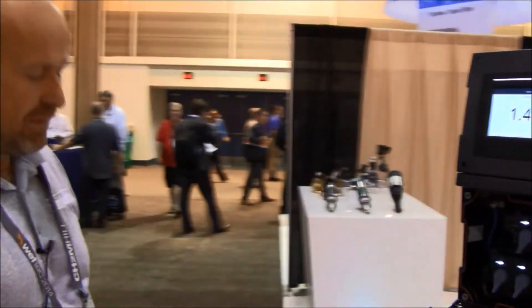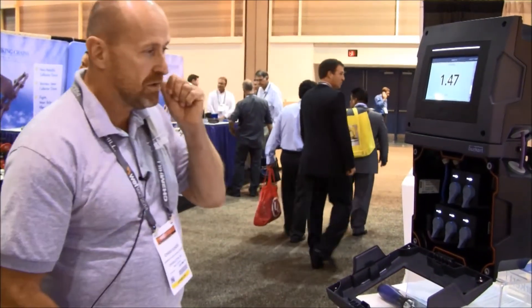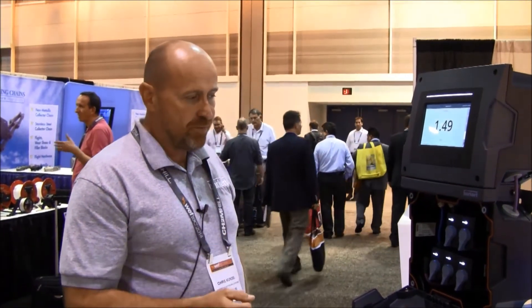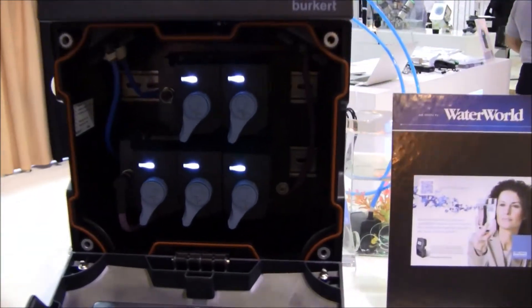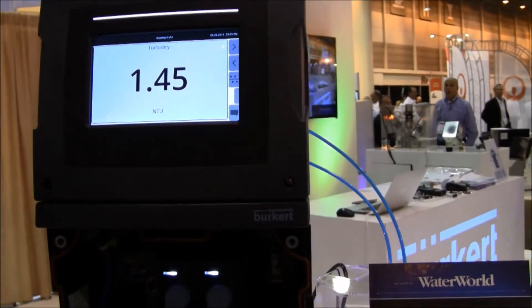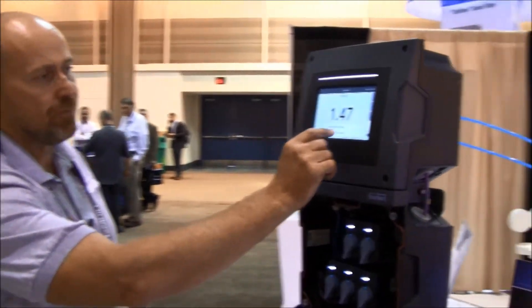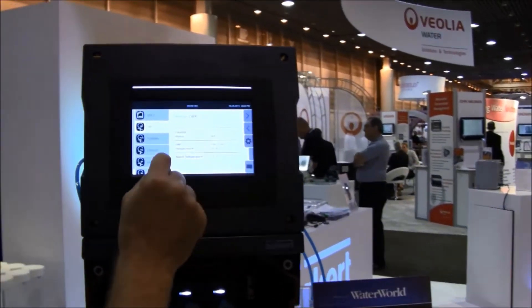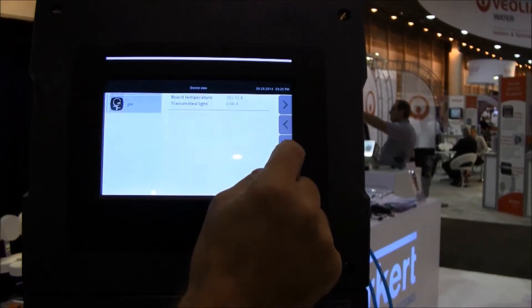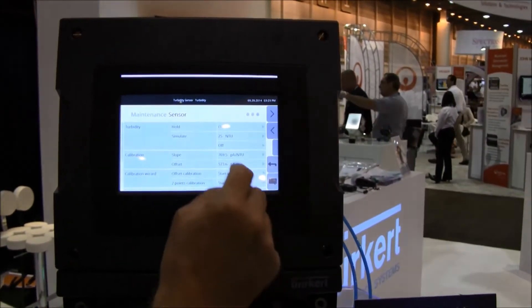The next topic is calibration. Sensors like pH, turbidity, chlorine, and sometimes conductivity need to be calibrated. One way to do it is to take a sample, analyze it with a separate unit, then go into the parameter setting menu and enter the calibration values in the different view. Once this is done, we are good to go.